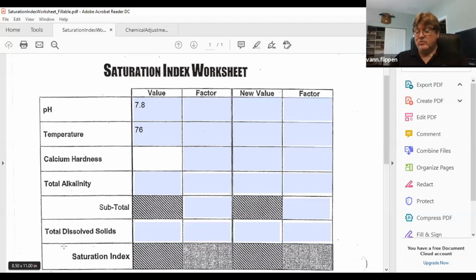So I've neutralized the free chlorine using the sodium thiosulfate. Then if I go to the box, I have to use 5 drops of the indicator, and this tells me if alkalinity is present. So I'm going to use 1, 2, 3, 4, 5 drops, and if the sample turns green, then alkalinity is present in the water. And the sample turns green. So I've got the alkalinity that's in the water.